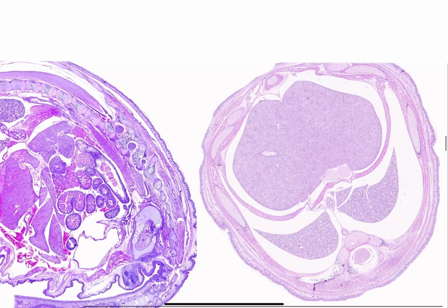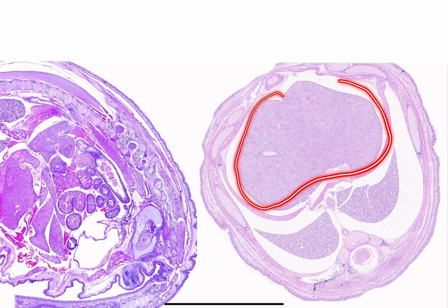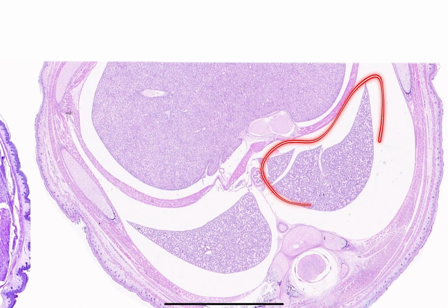Here we actually have the transverse section of the embryo. And what do I mean by that? Well, if you imagine the cut being from the belly button to the back, almost cut like a cucumber, that is what you see here. So here you see a pretty large organ, and this is the liver, and this would be the lungs. I hope the texture is recognizable to you.